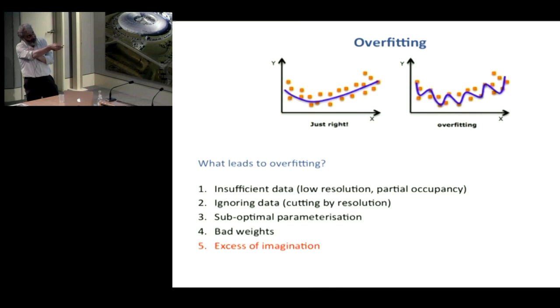You can increase the number of parameters and describe almost every point in the data. But then you describe your data as signal and noise. You describe the signal as well as the noise. What you would like is to describe the signal but not the noise. This is a very general problem in statistics. When you build a model, what's the purpose of the model? You would like to predict something in the future. If your model is overfitted to the noise, it will not have predictive power.